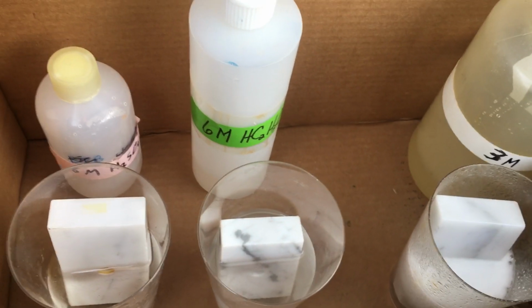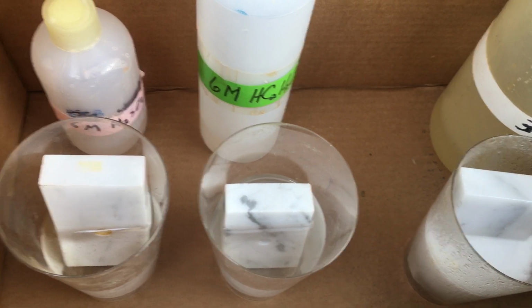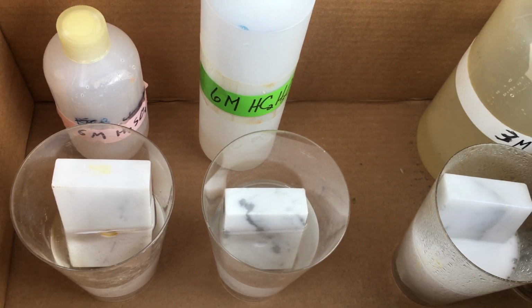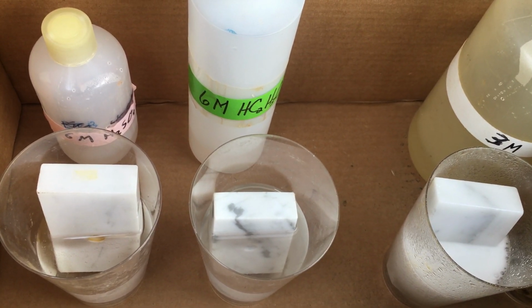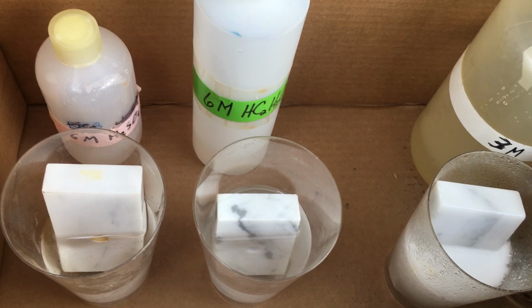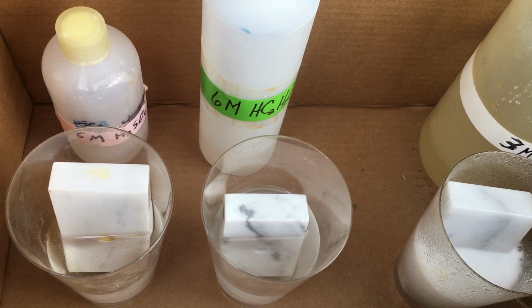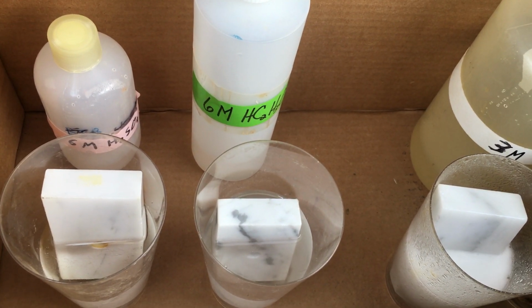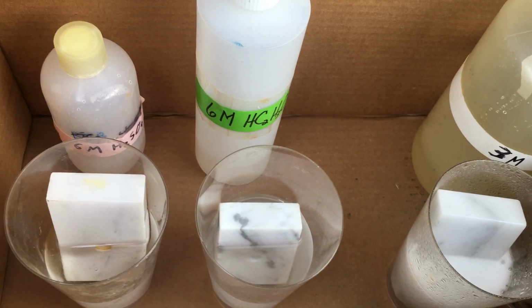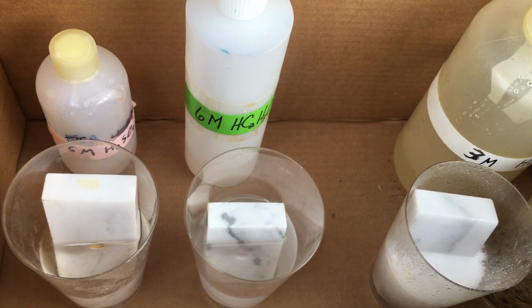Okay, our best guess as to what's happening here is the sulfuric acid is reacting with the calcium carbonate to produce calcium sulfate. And calcium sulfate is a material you find in plaster. And what appears to be happening is the sulfuric acid is probably making a bit of calcium sulfate on the surface of the marble and slowing the reaction down. So sulfuric acid, which is a major component of acid rain, will react with marble, but apparently the process is a little bit slower than I anticipated, because it first makes this soft calcium sulfate, which eventually wears away.